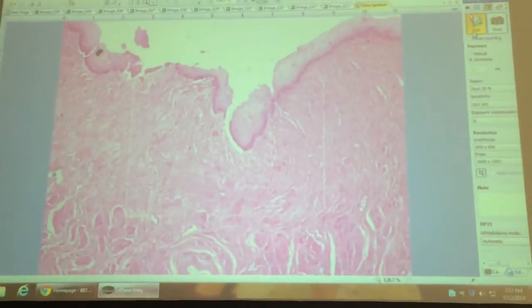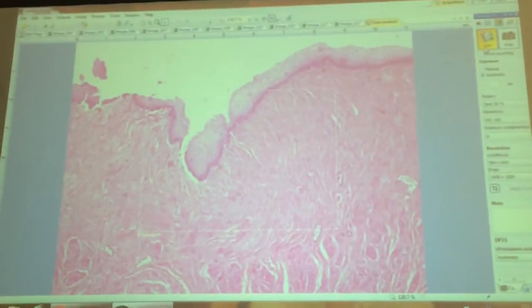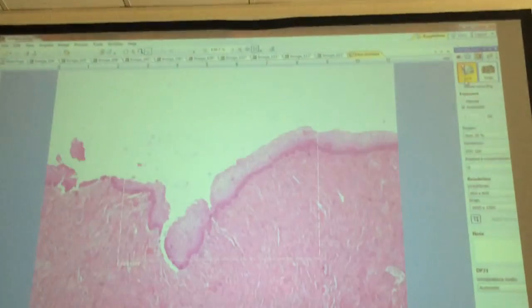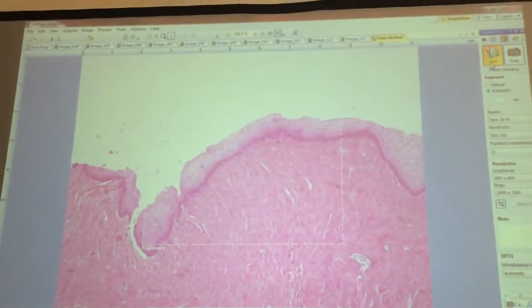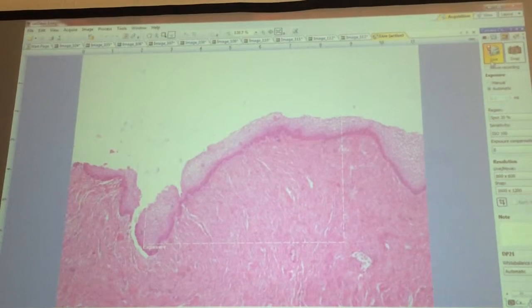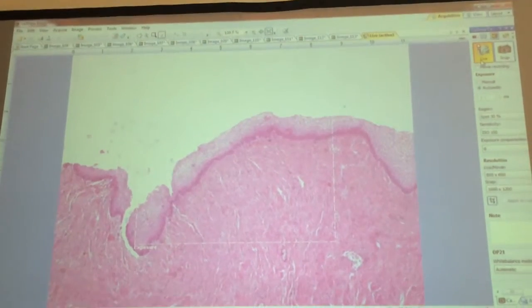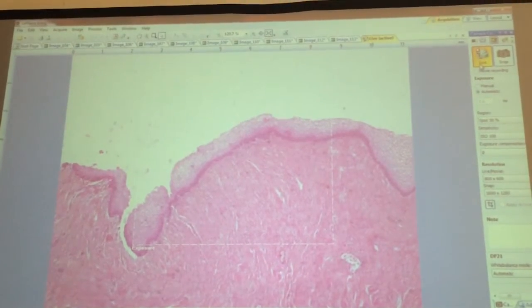And that's about it. Okay, so yeah, the vagina, and then you'll see that you have that stratified squamous epithelium, non-keratinized, sitting on a little bit of lamina propria. I'm not even seeing the majority of the lamina propria on this slide, so I'll look for a better slide for this vagina one to put up, okay, for the lamina propria. Sound all right on this one?